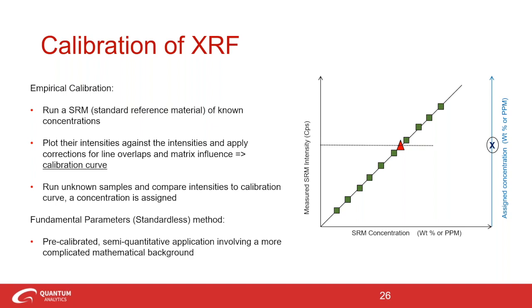So again, if you are using a third-party reference material, be cautious or consider the matrix that sample's made up of, right? And make sure you take that into account. You want to compare like to like samples. This will give you much better accuracy.